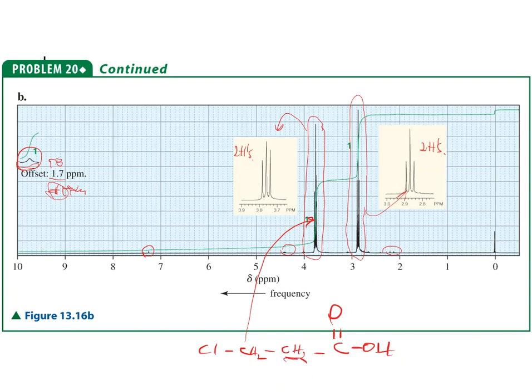And then this one is more in the middle, right? It's further away from that chlorine. This carbon has a double bond O, but that carbon's not necessarily too electronegative. It's the oxygen that's more electronegative. So we're seeing not as strong of an electron puller around that area, and its electron cloud is a little more dense. So that one is also going to be a triplet, and that's probably due to that one right there.